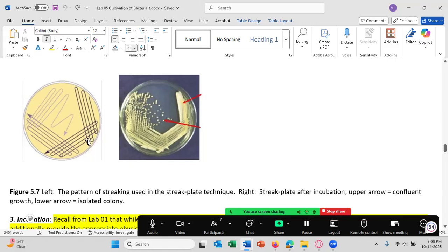Can you guys see my mouse? Anyone? Yes. All right. So you streak it in the low regions. You don't streak it in the high regions. And then you streak it out and you form quadrant 2. Once again, you streak it about 20 to 30 times.